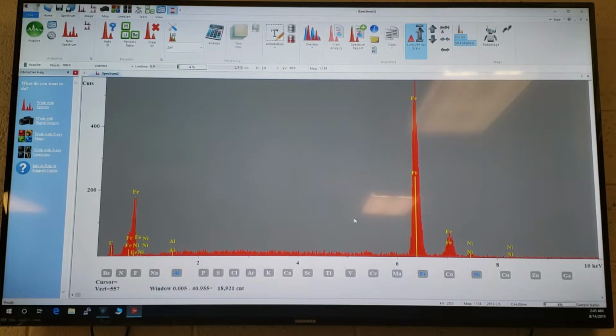Okay. How did you get that image window again? I clicked on a camera icon, but we haven't gotten there yet. Oh, I see. I just wanted to show you that the pull downs move the same. Right now, I don't know how the pull down one works. Yeah, the pull downs are the same, according to whatever main window you're on.